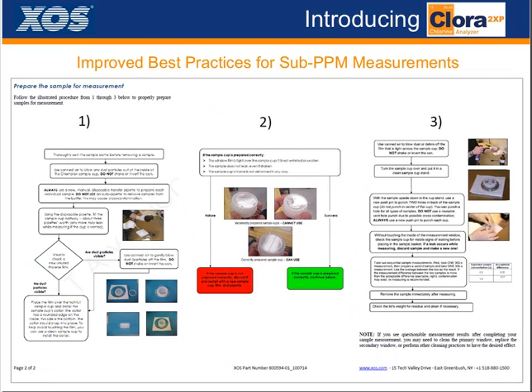And then also some other things that we've added here is just preparing the sample. Make sure that you're consistent when you make your samples, that you're cleaning the area around you, that you're not using cups that have been sitting out for a week in the open air, and that you're putting your film on your cups right. I know this all sounds very remedial, but even our statisticians who have done studies for us at ASTM before have said that the biggest variable between labs is the users, and part of that is the sample prep.